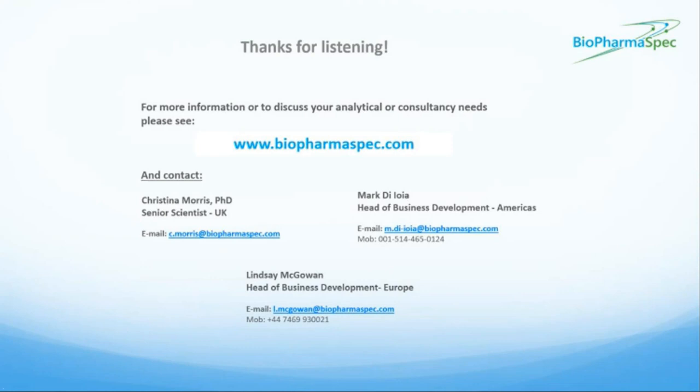So if you're looking at doing a full assessment where you're using a lysate, then it would probably be more appropriate to up the number of repeats that you're wanting to generate, just so that you're increasing the coverage and the depth, versus, say, just a quick overview check, and then it's less critical. All right, thank you.